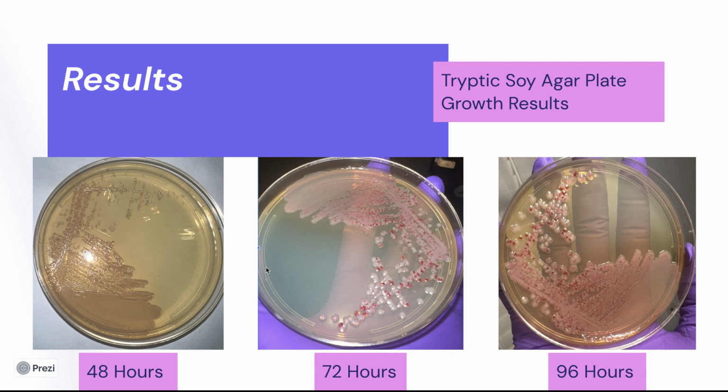If, however, say the bacterial species had the same color colonies, you would then have to use other methods. So I had mentioned earlier talking about colonies and a little bit about morphology type. Examples of this would be scientists being able to differentiate bacterial colonies by colony size, so maybe one's bigger or smaller than the other, the texture, elevation, form, and the margin of them. And I, of course, mentioned color as well.